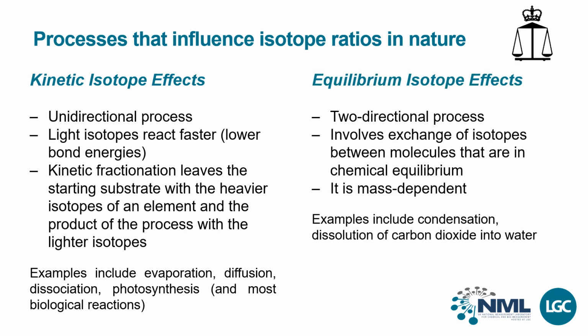Equilibrium isotope effects are not quite unidirectional, but they are not complete reactions either. The effect is associated with physical processes, similar to kinetic isotope fractionation, but describe how the isotopes are distributed among different phases of a molecule's existence in chemical equilibrium.